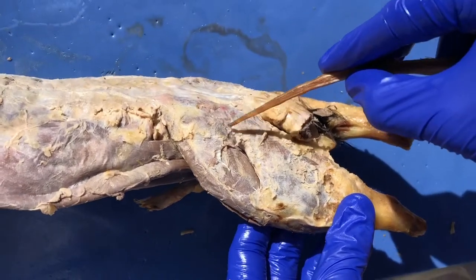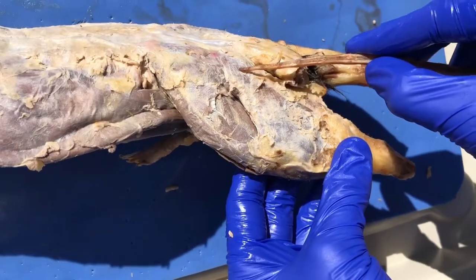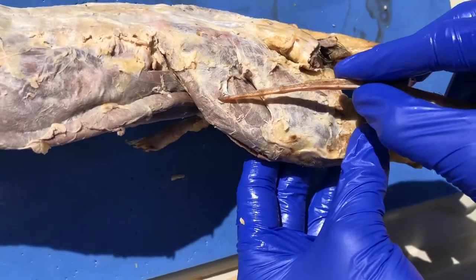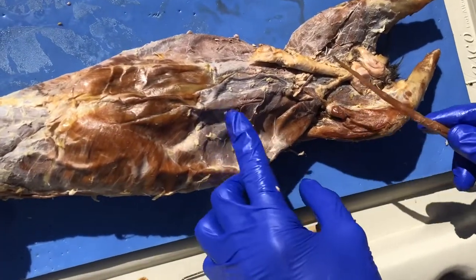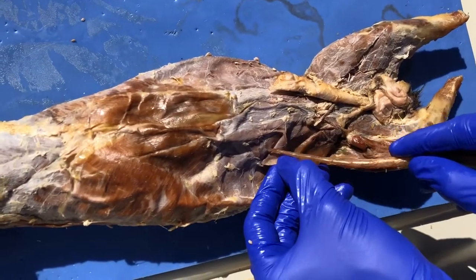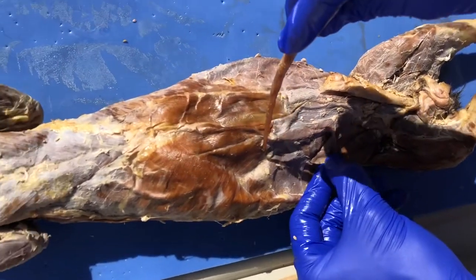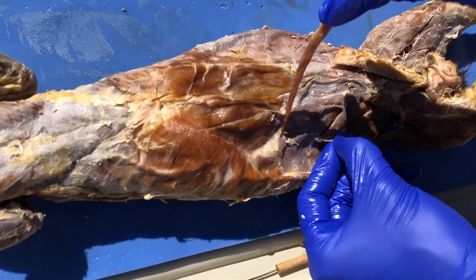The claudofemoralis is right in here, and then up here we have the gluteus maximus, and right down here is the tensor fasciae latae. Here we have the external abdominal oblique, and inside of it we have the internal abdominal oblique, and the inside is the transverse abdominis, and then supposedly along here is the rectus abdominis.